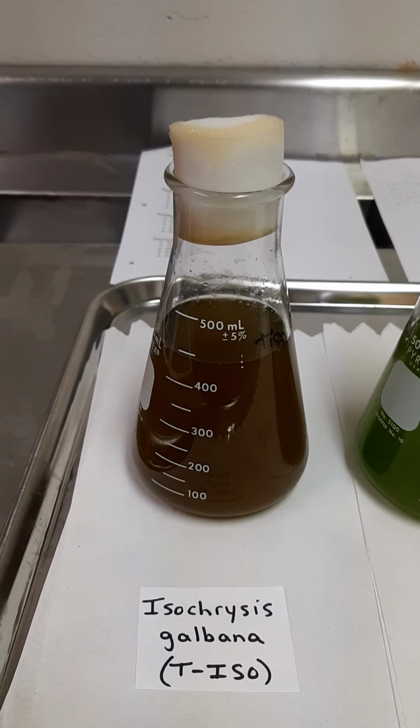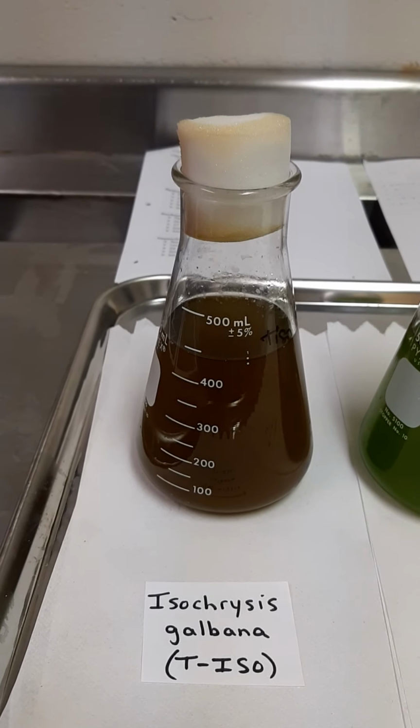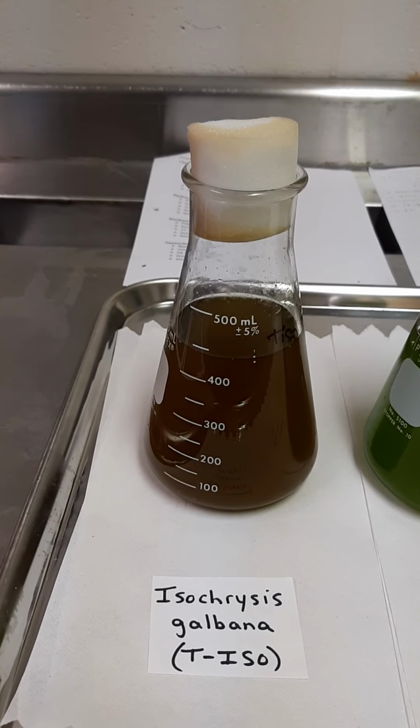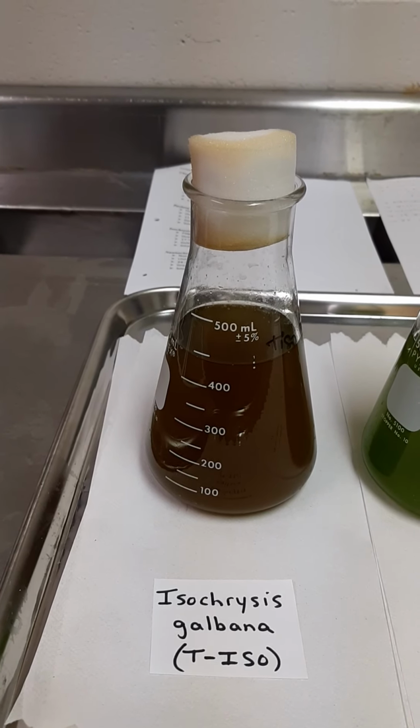This video will discuss the Phytoplankton Lab for the shellfish course. I will be showing you some different types of algae and how to actually take a sample to look at under the microscope to get your cell counts.